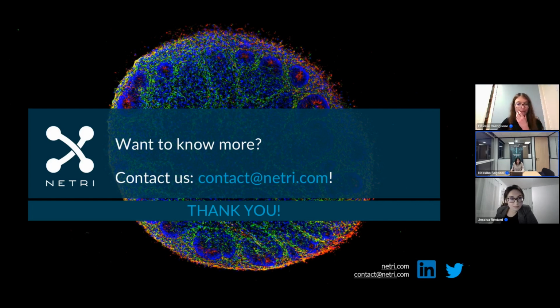Another one, are your cerebral organoids cultured under agitation? So Eloise, I think you can answer that. Yes, exactly. Like for the conventional culture conditions in 24 well plates that we put under constant agitation, we also put the chips under agitation using an orbital shaker at a speed of 18 RPM. Otherwise, we have noticed that the organoids tend to adhere onto the membrane of the duplex chip without agitation.